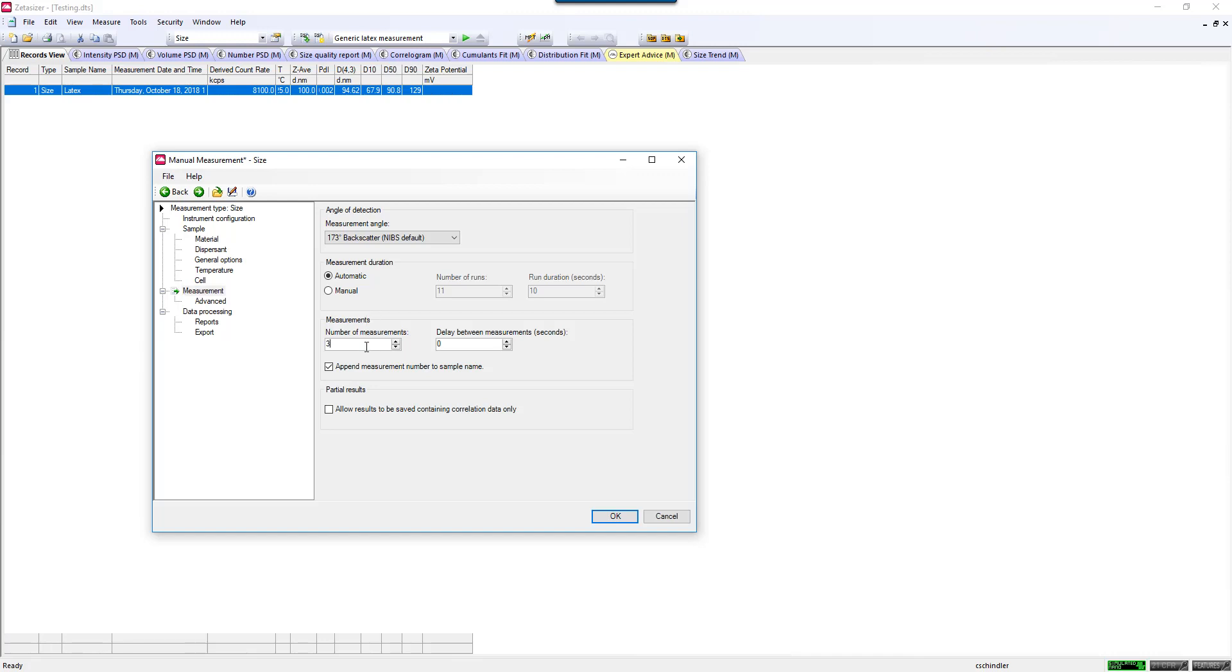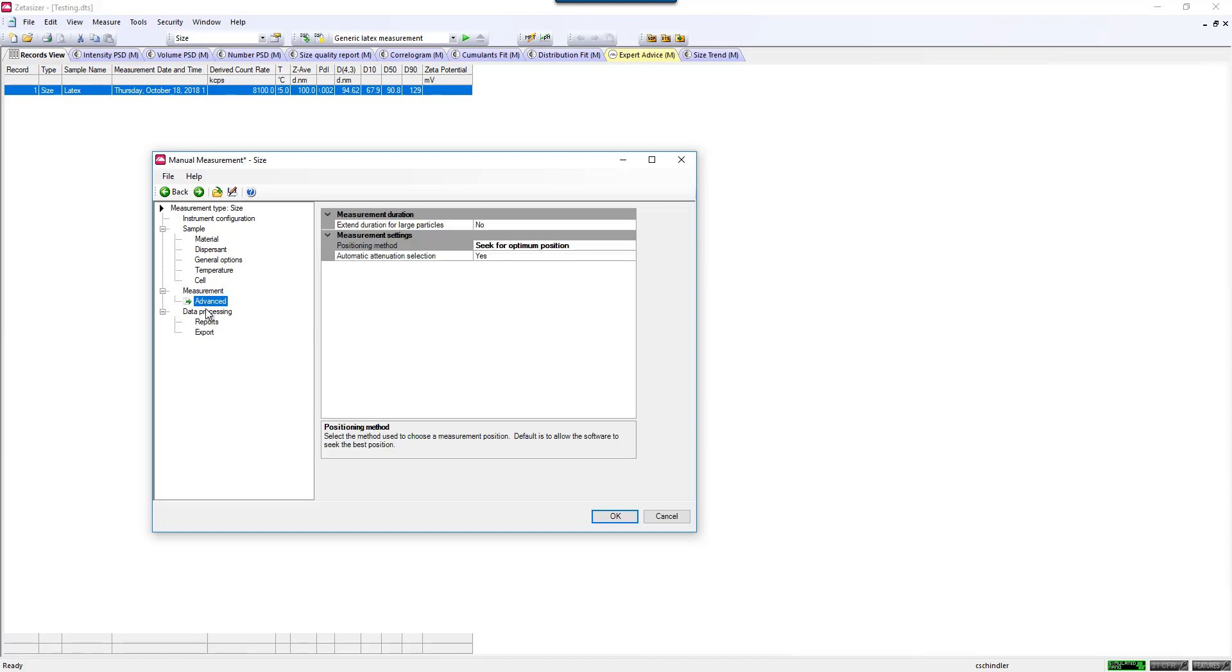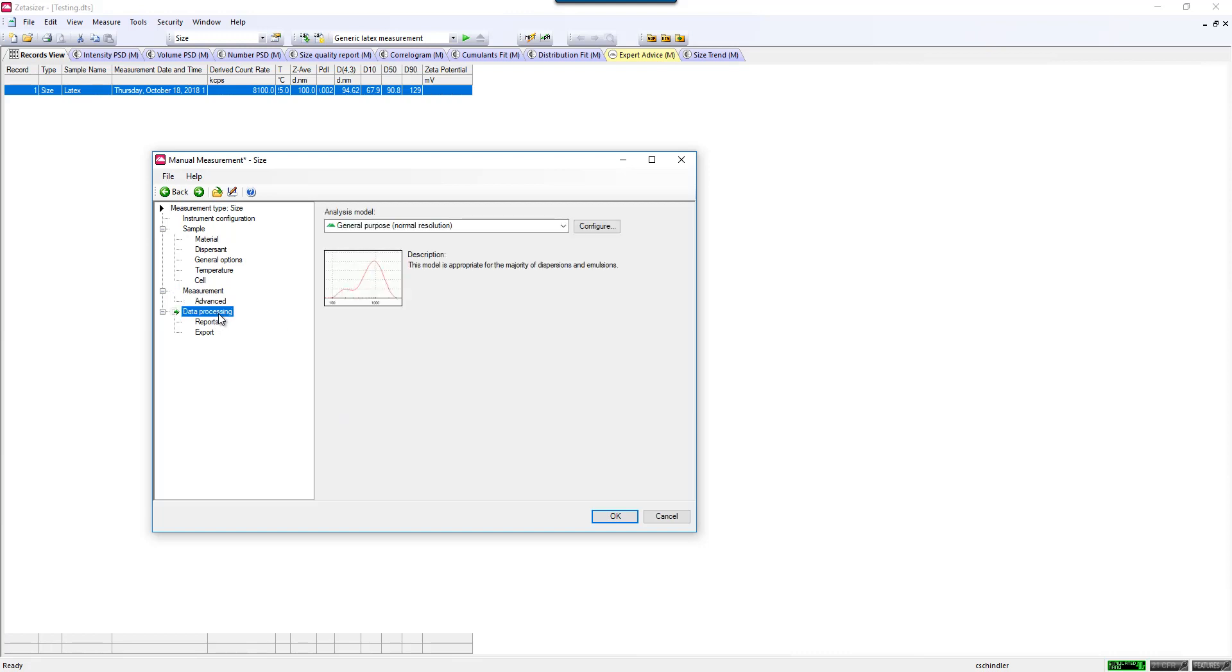You can do triplicate measurements, which I would probably recommend just to make sure that you're getting consistent data and your size is not trending one way, one direction or the other, which might suggest the sample might be sedimenting or aggregating during the course of the measurement. You can also add a delay time between measurements if you like. There are other advanced settings in here, but I will leave those to a different time.